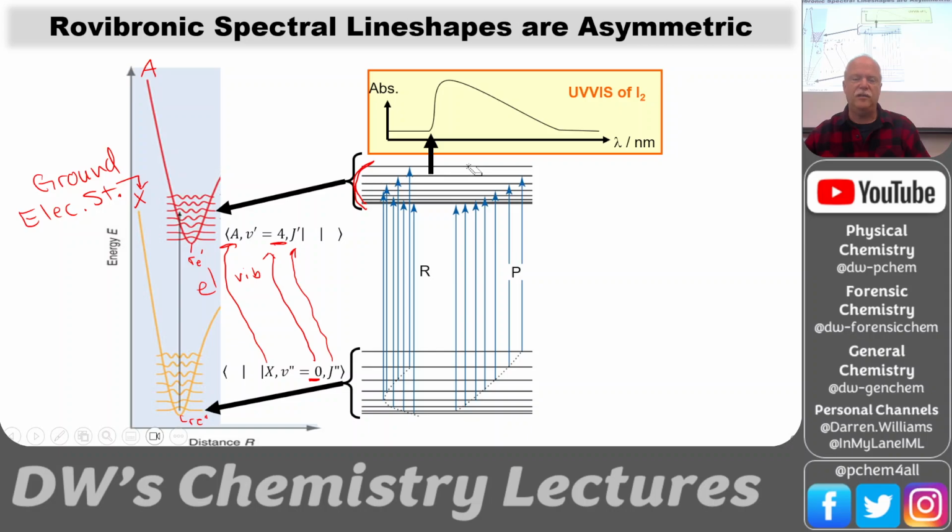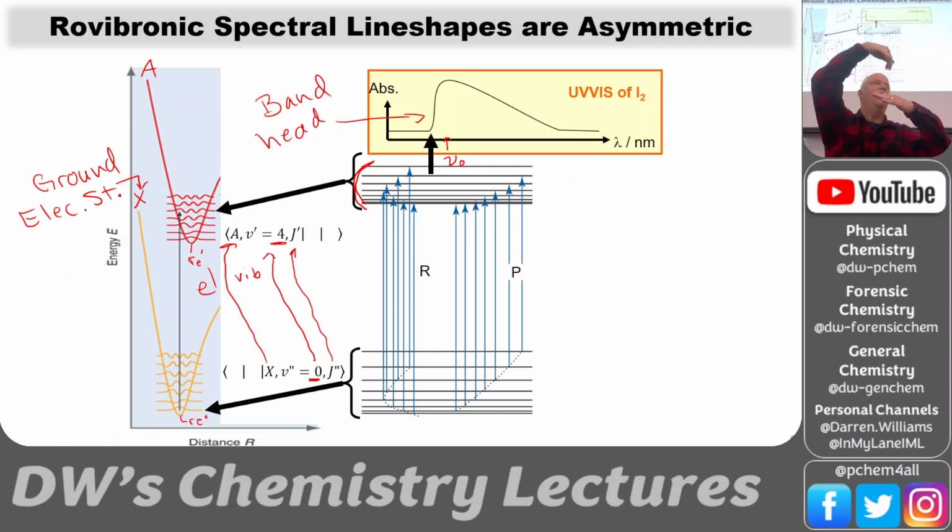And it's a common feature, so we see this right here. Somewhere in the middle here is the actual nu 0 that we would solve for. But the R branch over here is folded back over onto the P branch. And so this is called a band head. Kind of like a wave, like the head of a wave, right? It's moving to the left, if you will. And so we're just finding the steepest part of that wave of peaks.